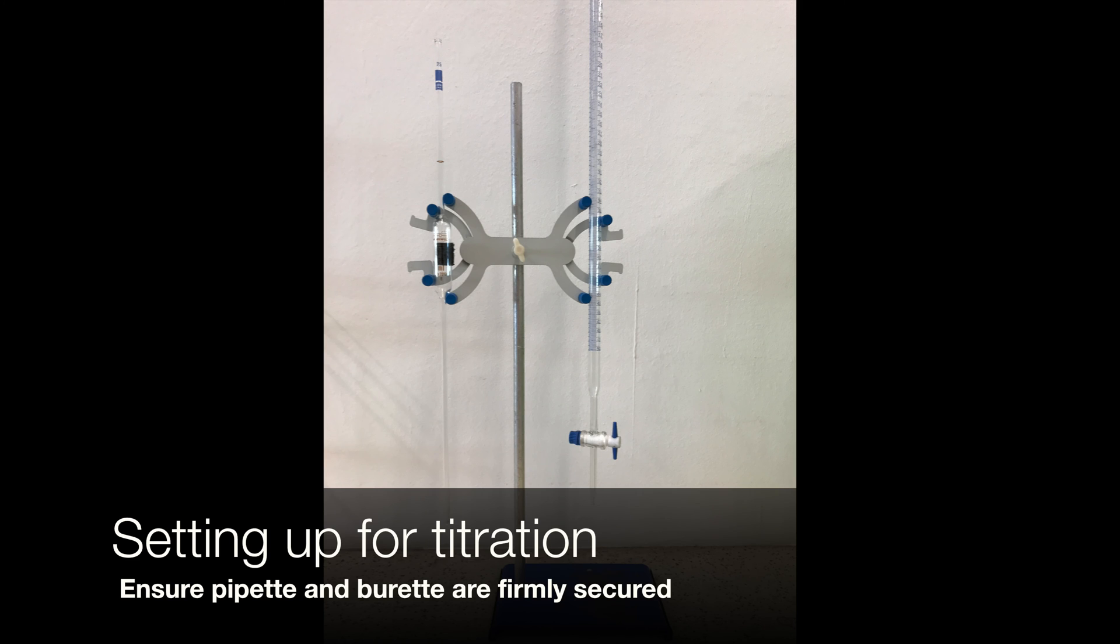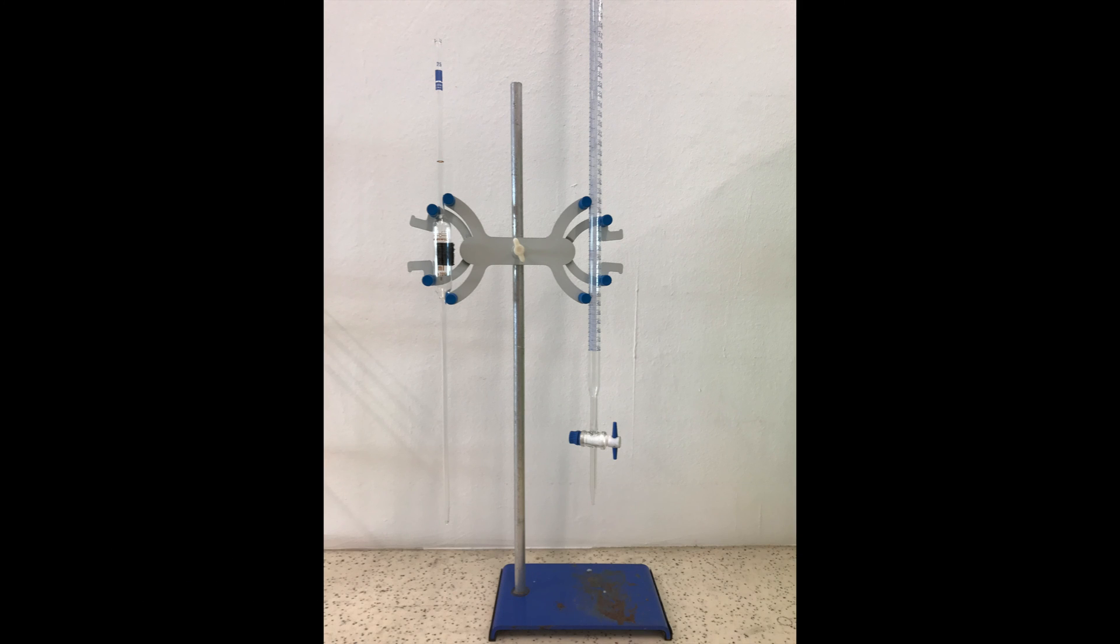Now we will set up the retort stand as follows. We have the pipette on one side and the burette on the other side. Note that the side with the burette should be directly above the base of the retort stand. We will need to place the white tile there later.